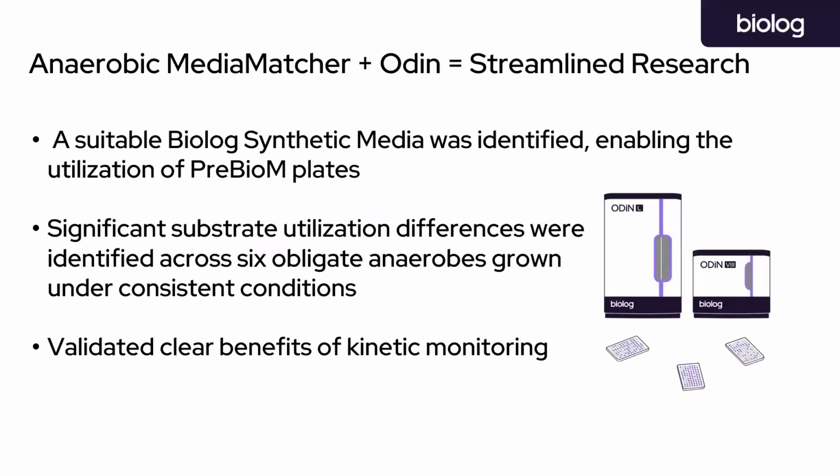To recap our findings, we were able to identify a suitable Biolog synthetic media for our 6 obligate anaerobes using the anaerobic MediaMatcher plate and transfer this media to the PreBioM plate line. This enabled an apples-to-apples comparison with anaerobic growth and kinetic OD monitoring taking place on our Odin instrument.